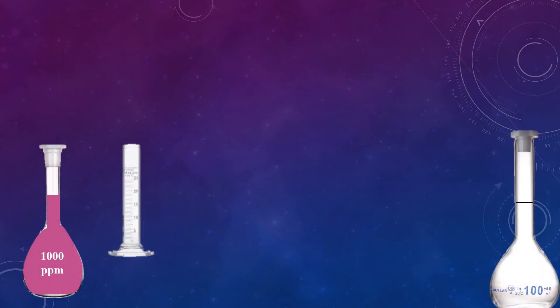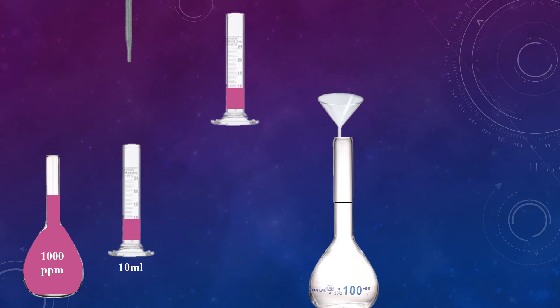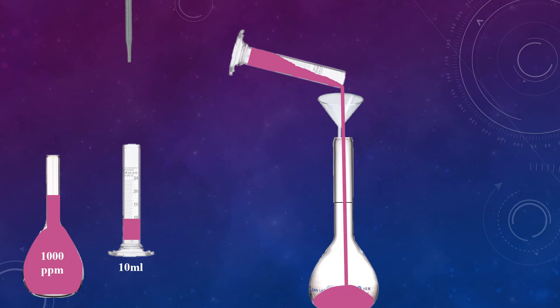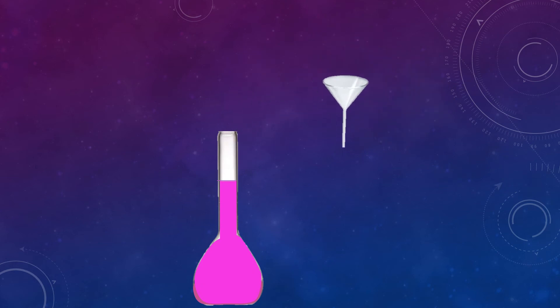First of all, take 10 ml from the stock solution of potassium permanganate using a pipette, and add it into the measuring cylinder. Open the flask and place the filter paper on the funnel. Add the solution into the 100 ml measuring flask. Always use filter paper to eliminate chances of any type of impurity. Add water up to the mark and store the solution for further use. This will be 100 ml of 100 ppm potassium permanganate, prepared from 1000 ppm stock solution.